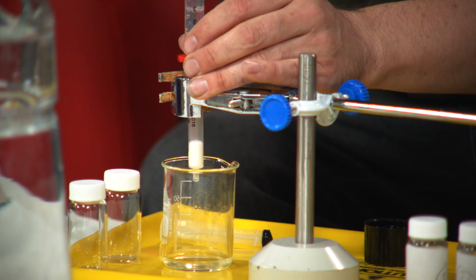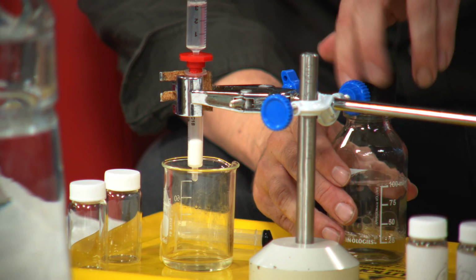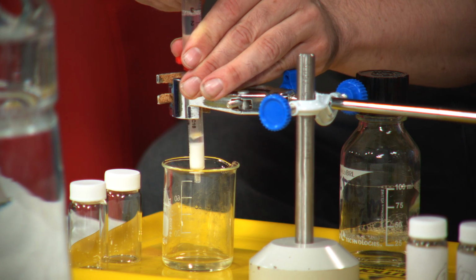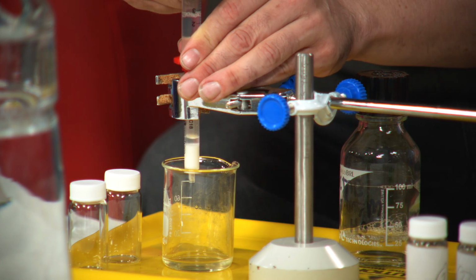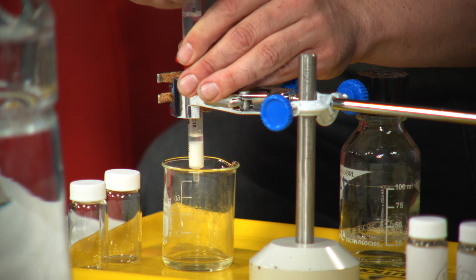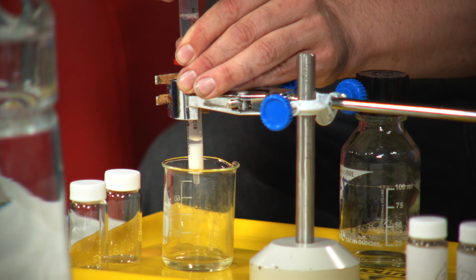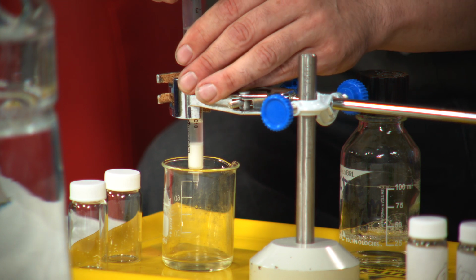3 mils. Try to make it not go everywhere. That's basically what I'm trying to do. So 3 mils. Same idea. Thing in. This is basically just like a bit like washing up liquid. So you might sometimes see it, you might see it froth if you look carefully.